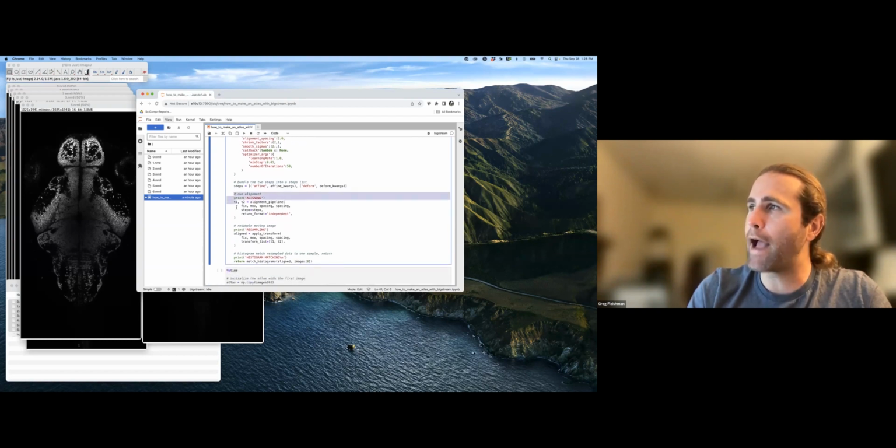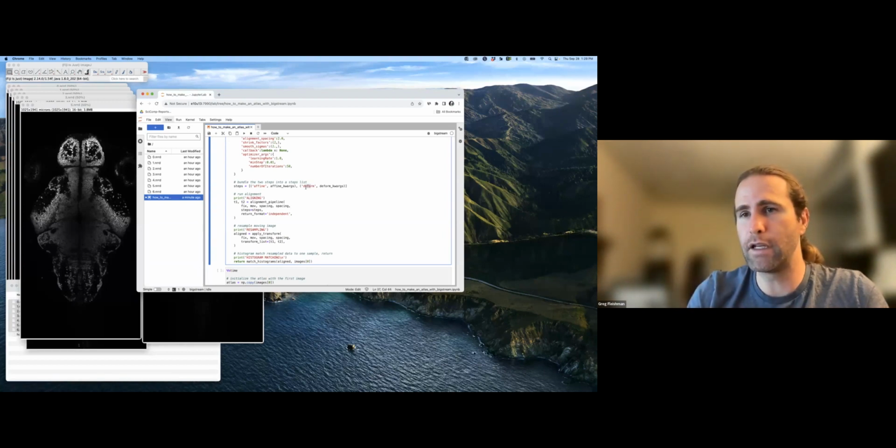And here's where we actually run the alignment. So we're saying take the fixed and moving image. We know that they have the same voxel spacing in this particular case. And I want you to run these alignment steps on them that we defined here in this list. And that's going to return 2 independent transforms: T1, which is an affine associated with the first step, and T2, which is a deformable alignment associated with the second step. That's all been shown in how-to meetings before.